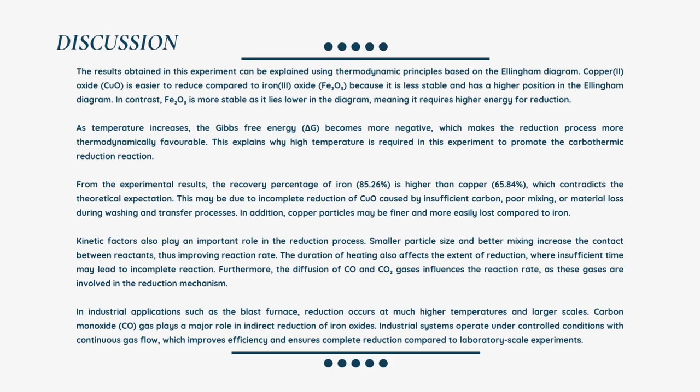In addition, many factors such as particle size, mixing efficiency, heating time, and gas diffusion also influence the reduction process. Overall, the result shows that experimental conditions play an important role in determining the outcome.